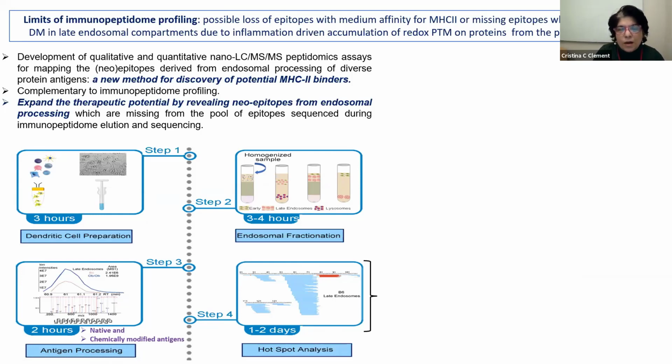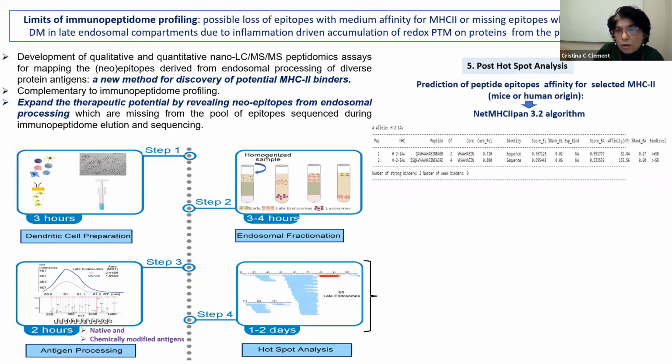So you can have a readout of different peptidomes derived under different conditions and under different folding states for your antigen.